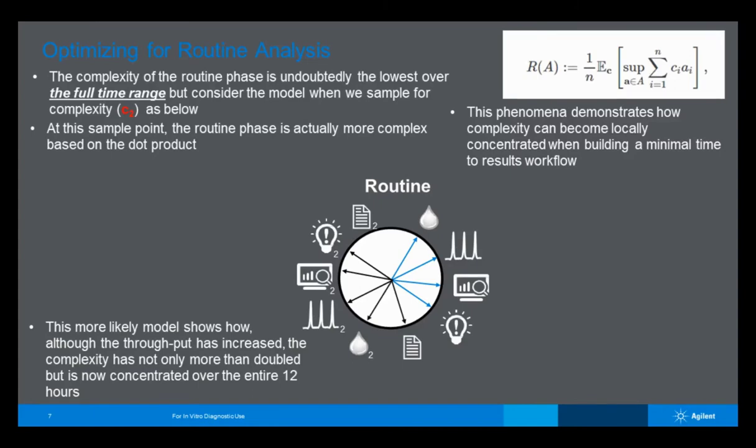So what's more likely is what you would see in the illustration here, where you've started one cycle and you've actually increased that one cycle because you've started another cycle there too, because you know that you can complete this within a 12-hour period, and that's far more likely. You'll also notice that there's an additional inflection point that's been included here. So before we only had 4 inflection points. Now for our second cycle, we actually have 5. And the reason that we have 5 is because we can no longer assume that we have infinite rest before and after.